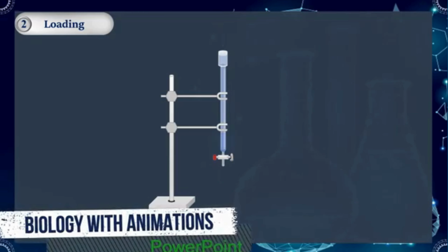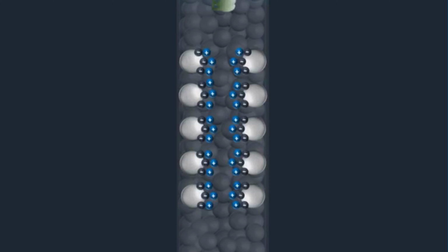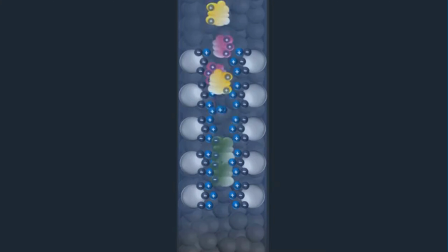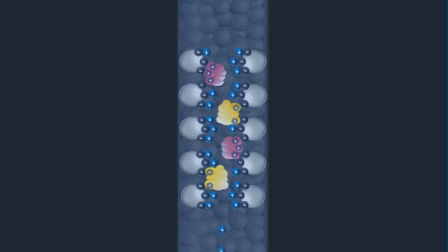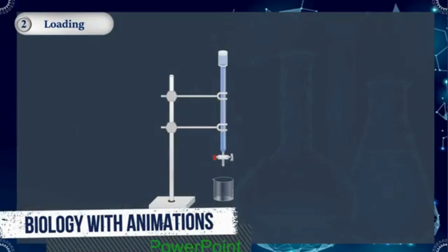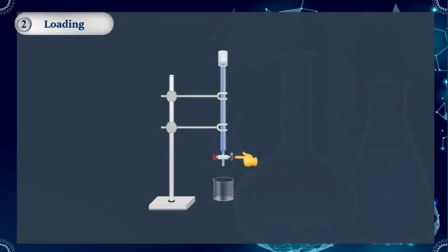NaCl or brine. Proton cation exchanger, regenerant mineral acid. Chloride strong anion exchanger, regenerant sodium chloride. Hydroxide anion exchanger, regenerant sodium hydroxide. A typical cycle is service or loading, to backwash, to regeneration, to slow rinse, to fast rinse, to re-equilibration, to service.